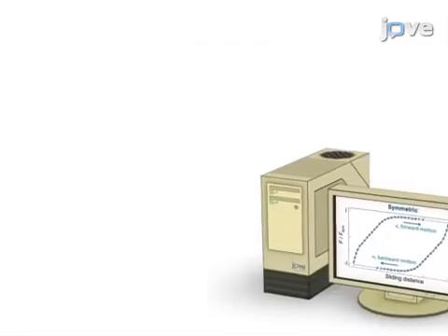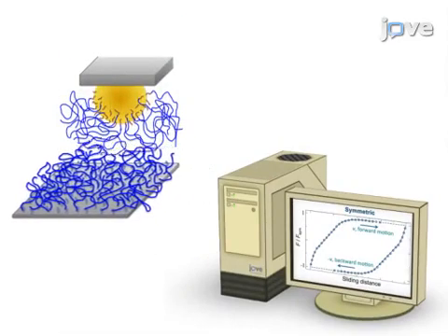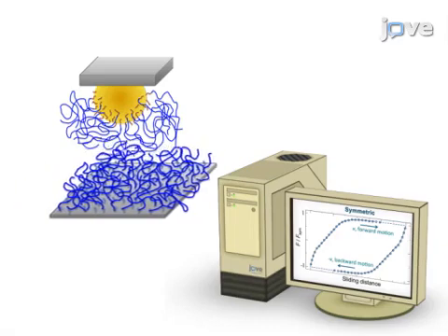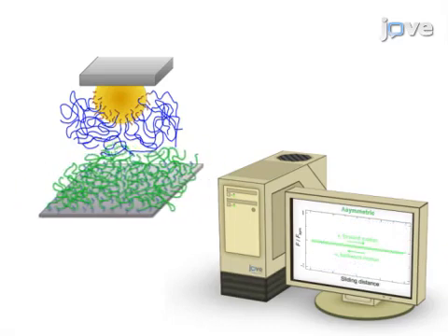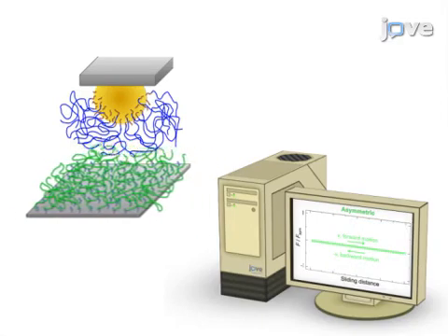Next, mount the force measurement probe into an atomic force microscope. Mount a solvated PMMA brush surface as a sample to measure friction for miscible brush systems. Mount a solvated P-NiPAM brush surface to measure friction for immiscible brush systems.